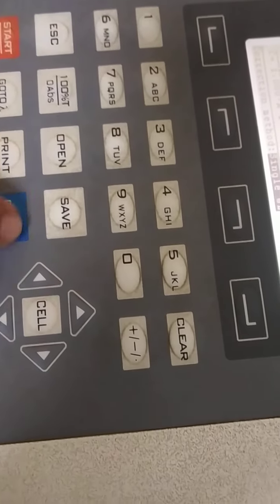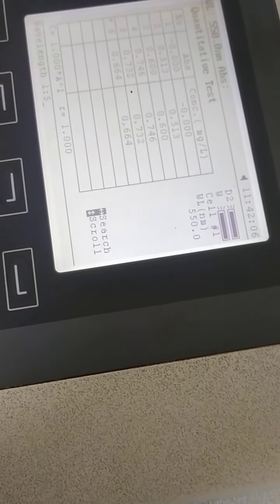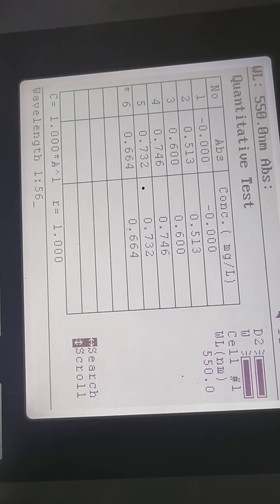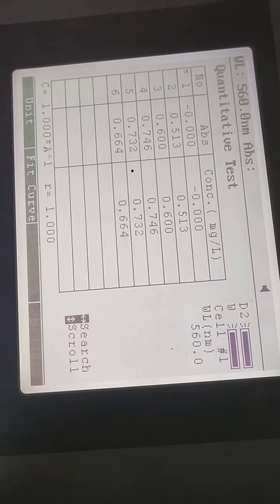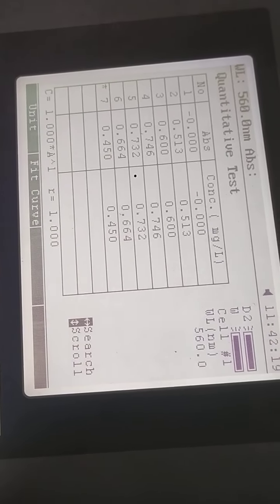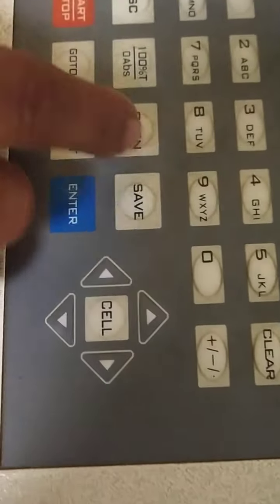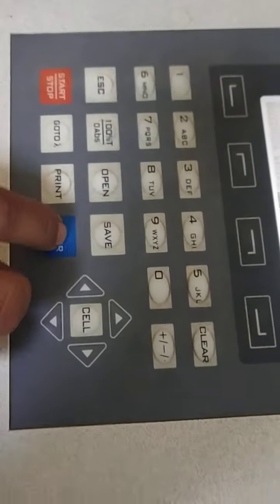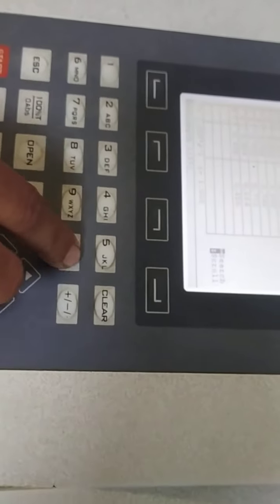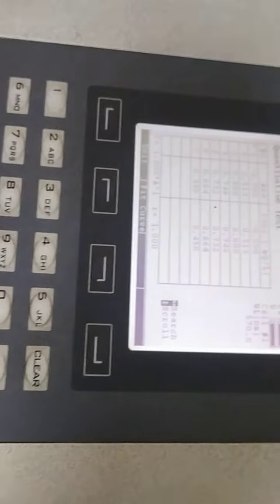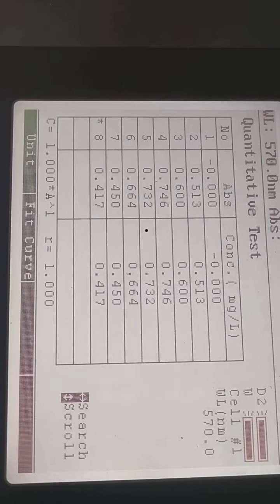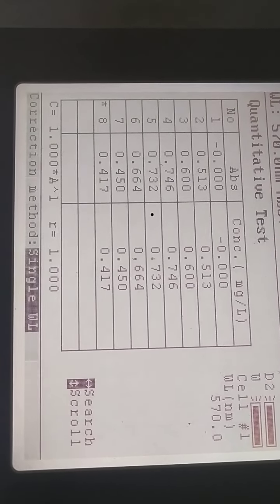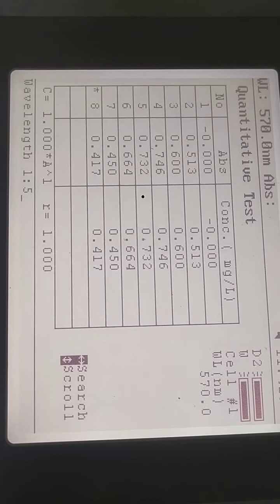Now further we want to change our wavelength to 560. Now further we want to change our wavelength to 570. Now further we want to change our wavelength to 580.